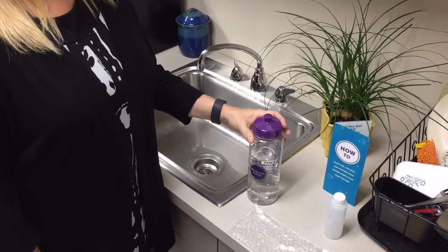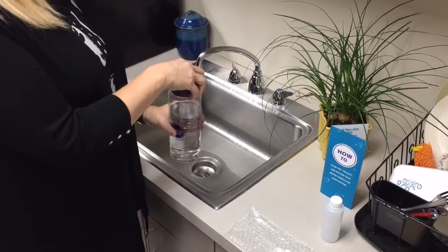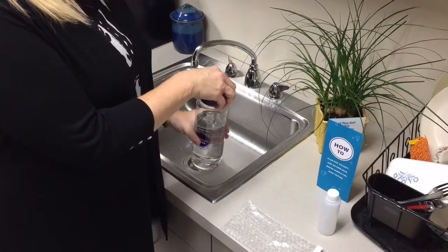Test your water from a kitchen faucet, either in the morning or after returning home from work. This allows your water to sit at least six hours before you sample. Here are the ten simple steps.